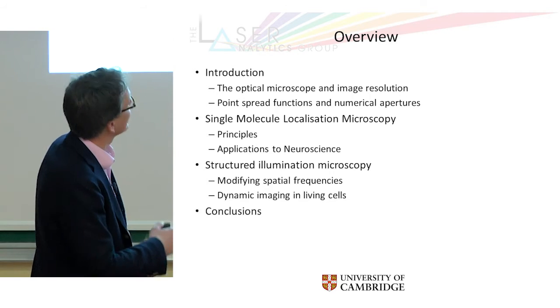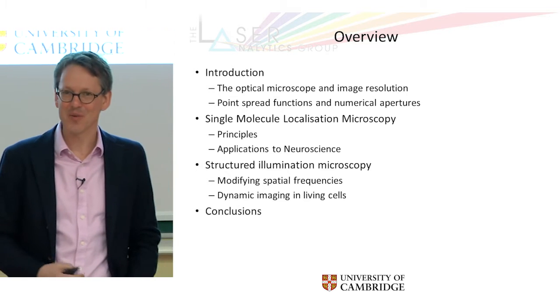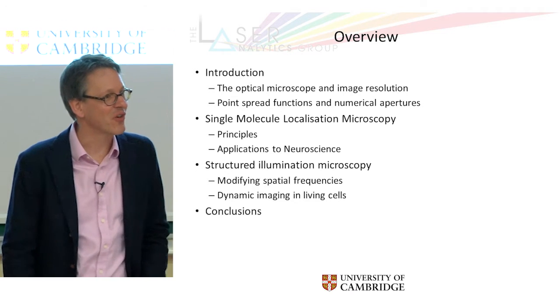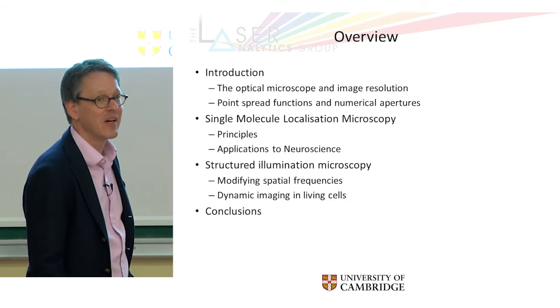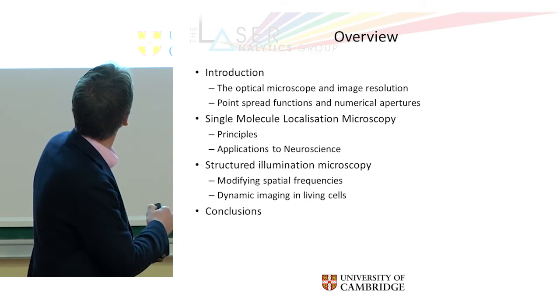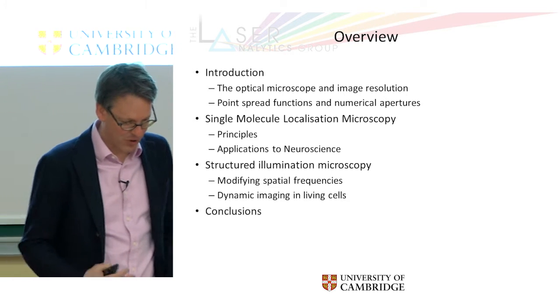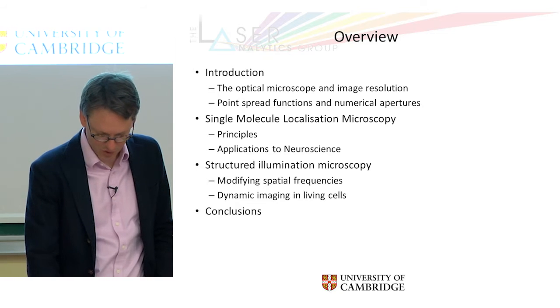Before I do that, I'll give you an introduction just to show you briefly what degrades image quality in microscopes, so we understand these techniques in a little bit more detail. I will particularly go into these concepts of point spread functions and numerical apertures, which will set the scene for the rest of what I talk about.